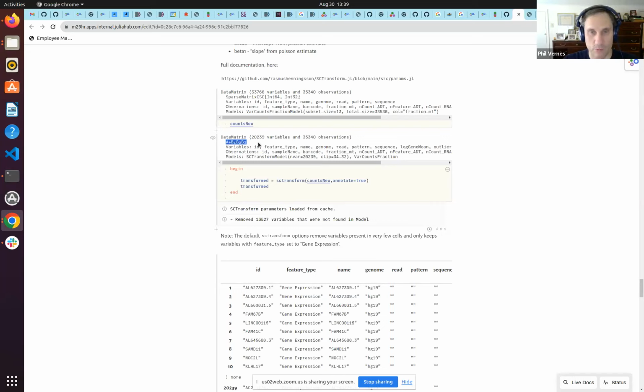The dynamic program will look at the actual matrices involved and say, okay, this one is upper triangular and this one is symmetric, so this has a cost function of that compared to this approach for evaluating the same expression. It's going to look at different ways to evaluate this expression and choose the one that has the lowest cost. And it does that using a dynamic program. Once that lowest cost is found, that's the method for evaluating it.